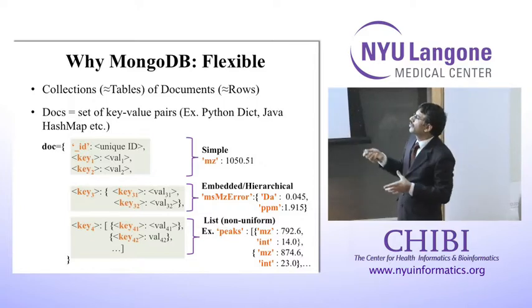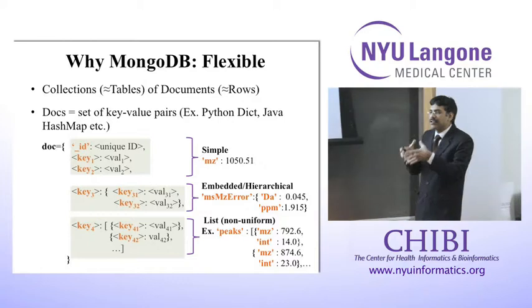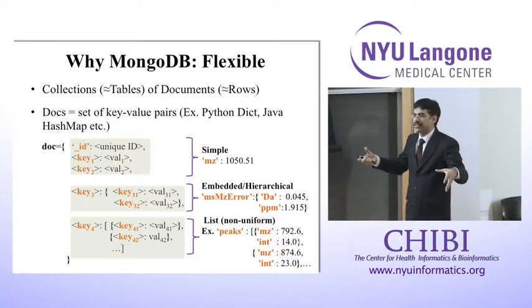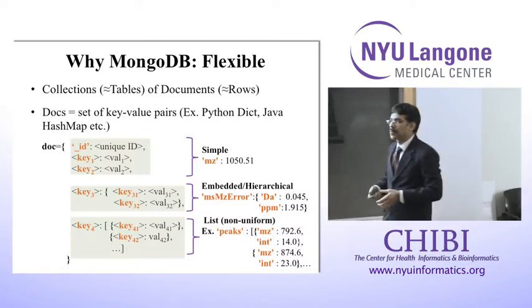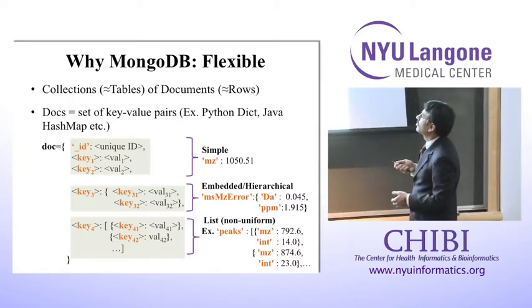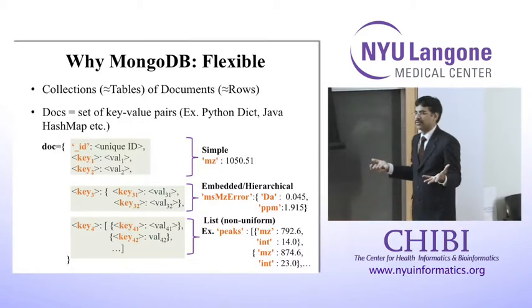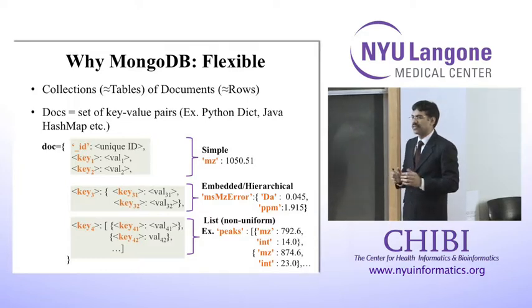Whereas here, you store this information as a unit. You don't store it in separate dictionaries referencing different dictionaries. You store it in one key value pair. So you have this unique ID. It's like a series of embedded dictionaries. Yes, so you have this unique identifier. This is what you need to query in order to get all the information about your peptide spectrum match. You don't have to go to different tables to extract the information. Does that make any sense?